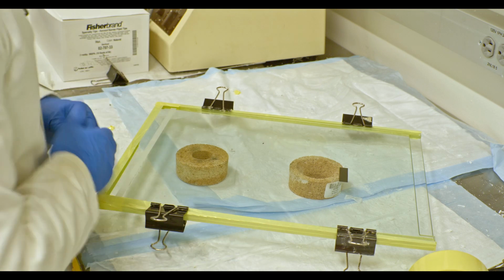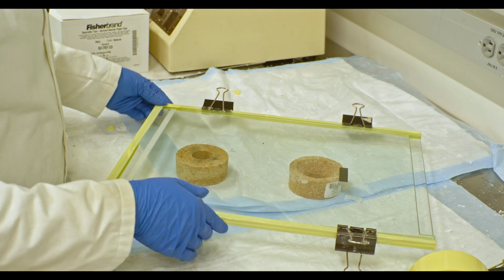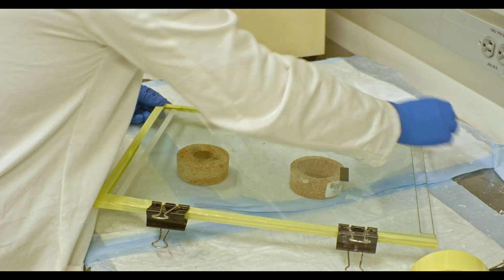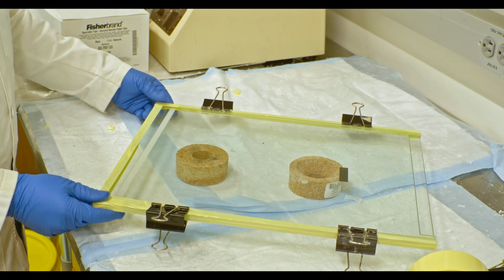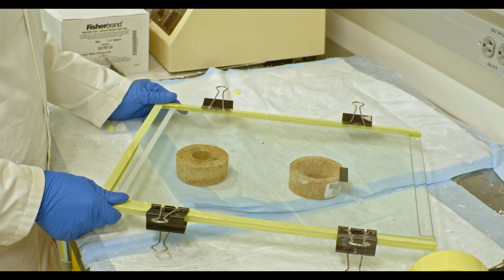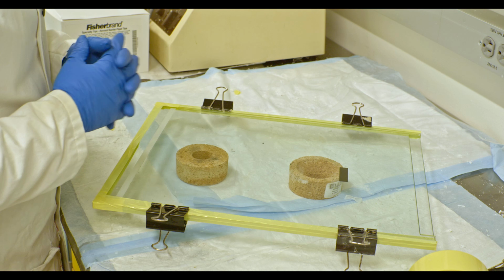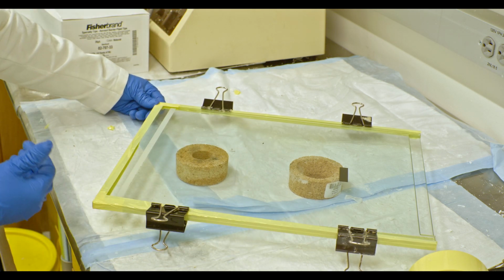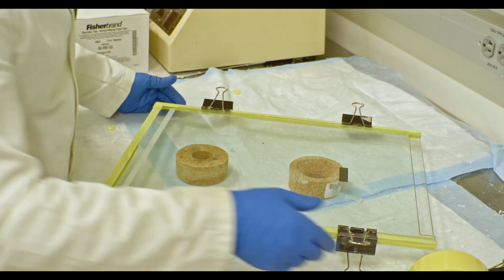All right, and now you're done. You have effectively taped the sides really well. If you have any corners that you might be a little worried about, for example, the corners that I would worry about are down here on the bottom of the gel. You can retape those as much as you'd like. I wouldn't go over 3 layers, of course, because I feel like that's not only wasting your time a little bit, but that will also make some of this tape harder to take off, because eventually once you lay down the gel and let it set, you do have to take the pieces of tape off.